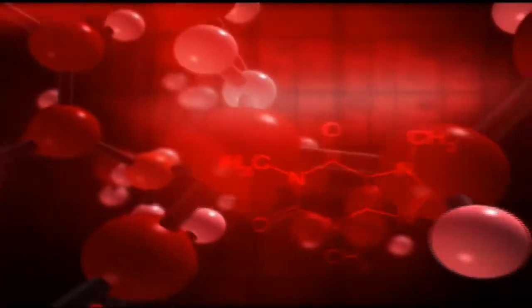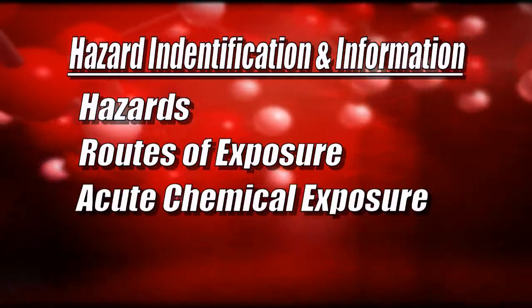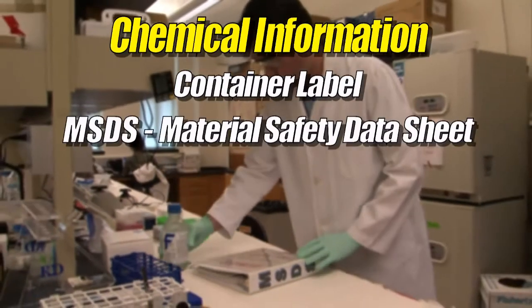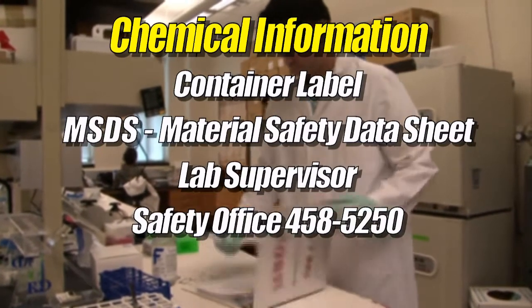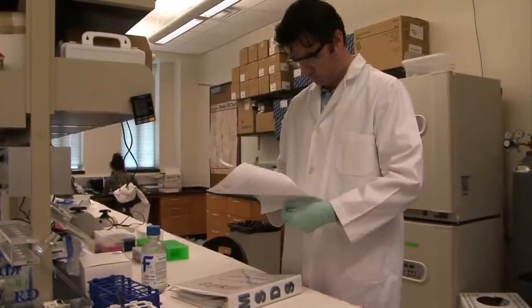By following these guidelines, you will learn the various hazards, routes of exposure, as well as acute or chronic exposure information of laboratory chemicals. This information is on the container label, the associated material safety data sheet, or by asking your teaching assistant or lab supervisor. You may also call the safety office at 458-5250, or contact the manufacturer or distributor of the chemical if needed.